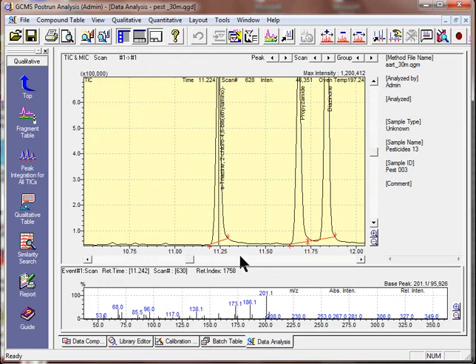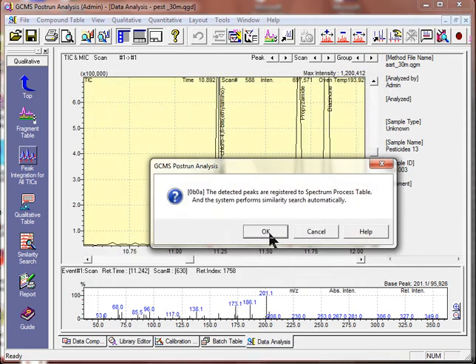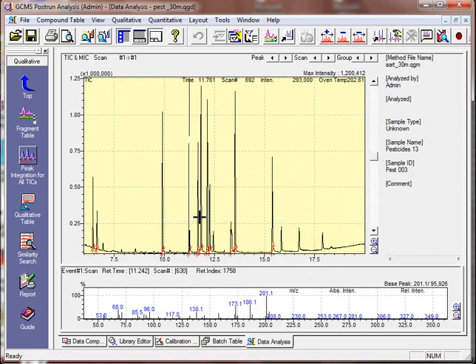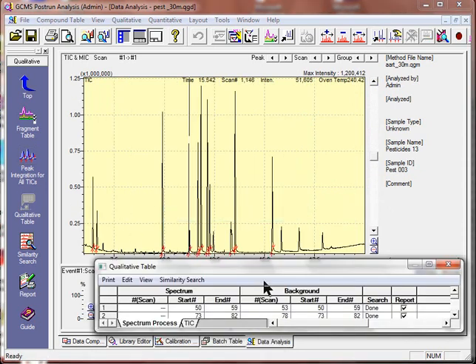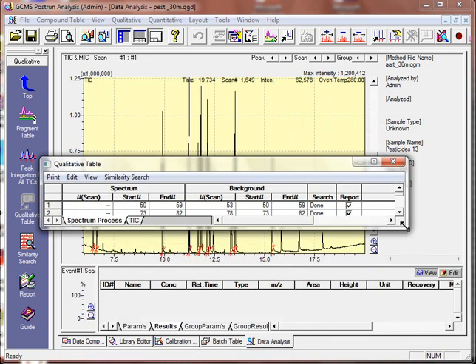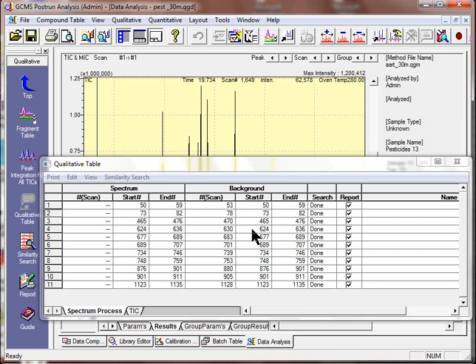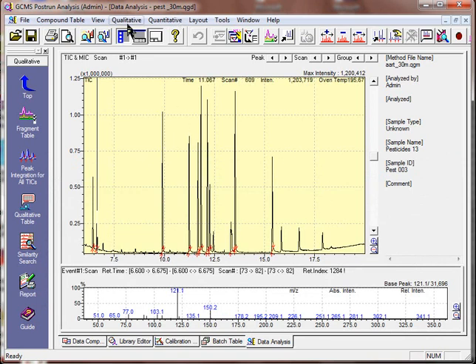So after activating this, we make a peak integration again. And what we see here is that there is actually no result with the retention index similarity in the NIST library. In other words, a similarity index bigger than 75 and a linear retention index within that window doesn't lead to an identification in the NIST library.